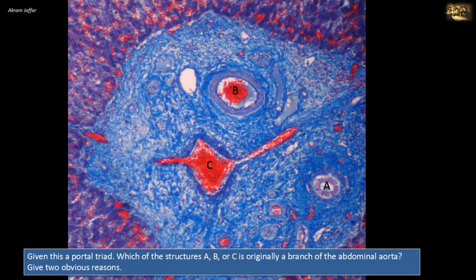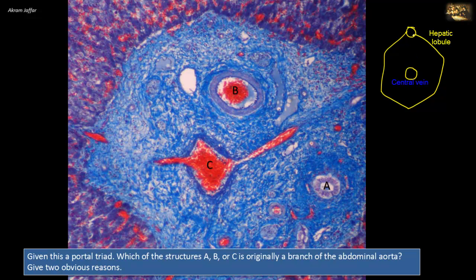Given this is a portal triad, which of the structures A, B, or C is originally a branch of the abdominal aorta? Give two obvious reasons. Portal tracts are positioned at the angles of the hexagon of the hepatic lobule. The central vein is at the center, and the portal tracts are located at the angles. A portal tract contains three main structures, hence the name portal triad.